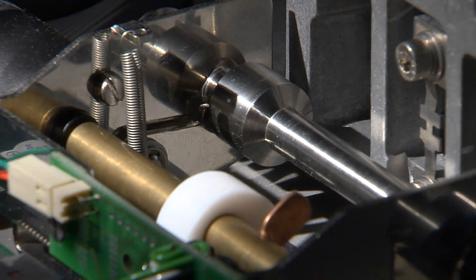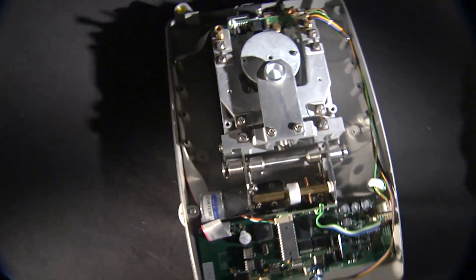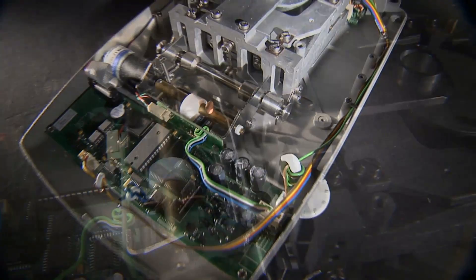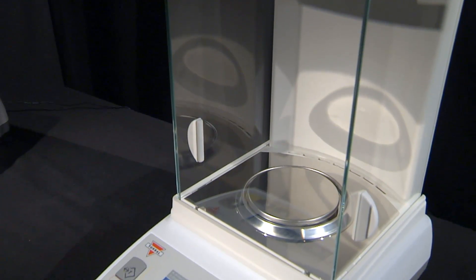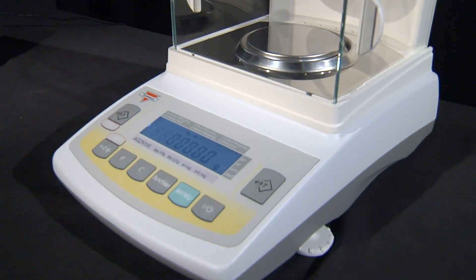The internal calibration mechanism is designed to calibrate the scale automatically at startup, at preset time intervals, or whenever required by internal temperature changes. The AGC line includes analytical balances with a resolution of one tenth of a milligram, available in 100 and 200 gram capacity.